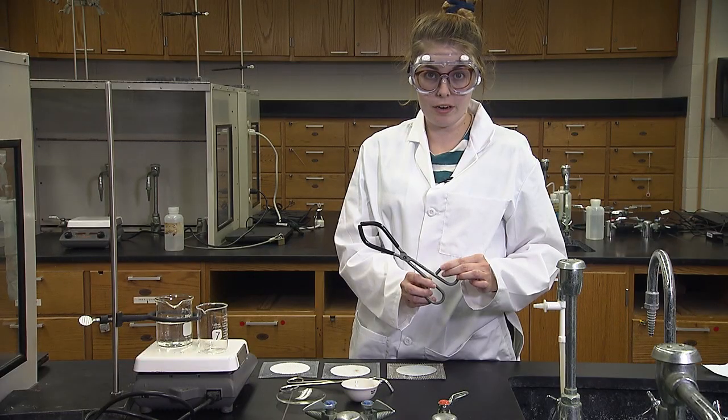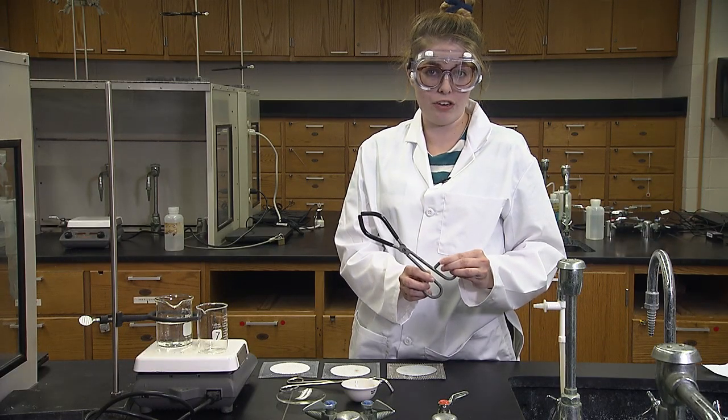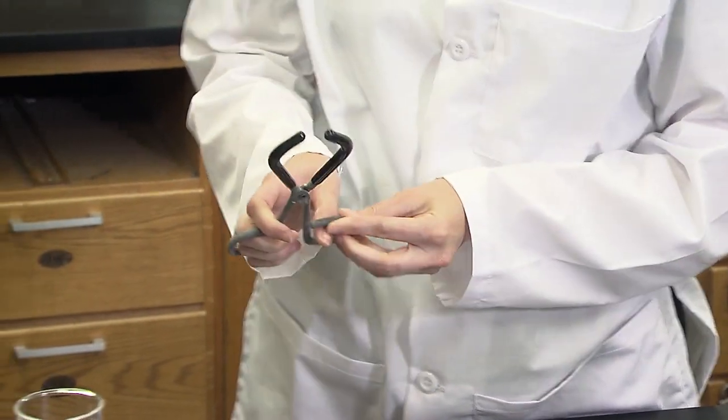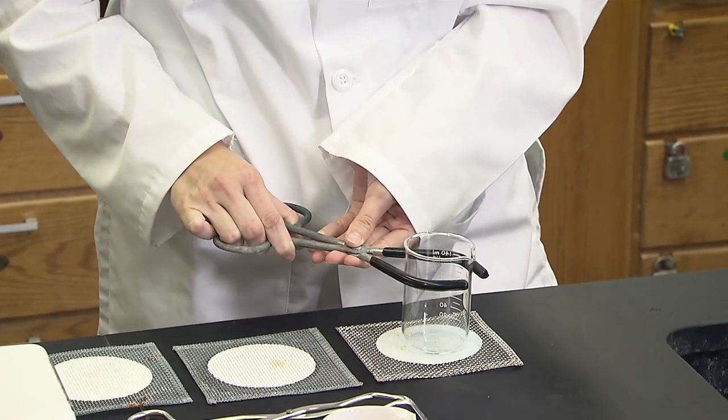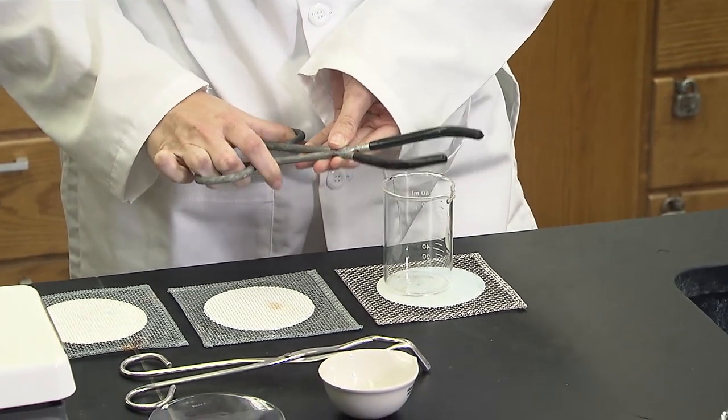When removing the beaker, you will use beaker tongs found in the general equipment drawer. Always move hot glassware to a heat-resistant mat found in the general equipment drawer.